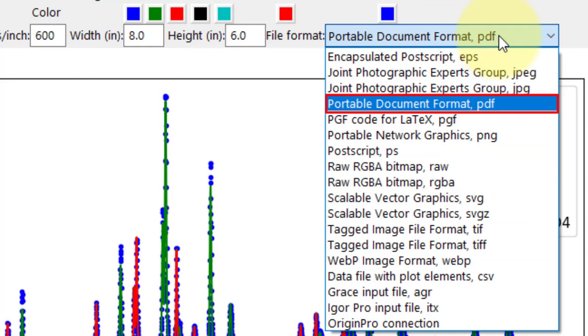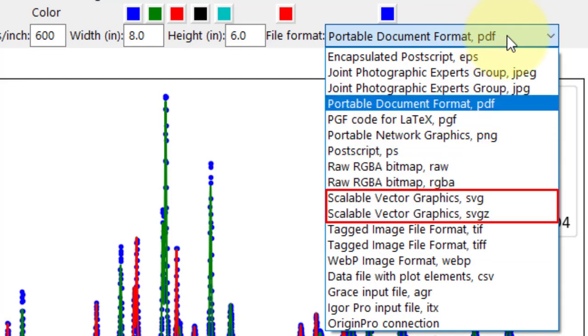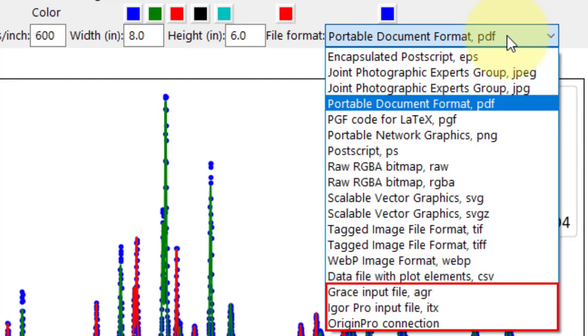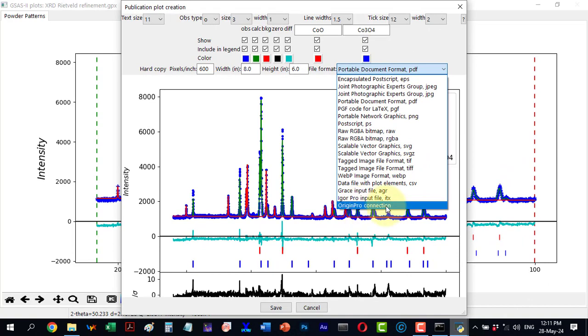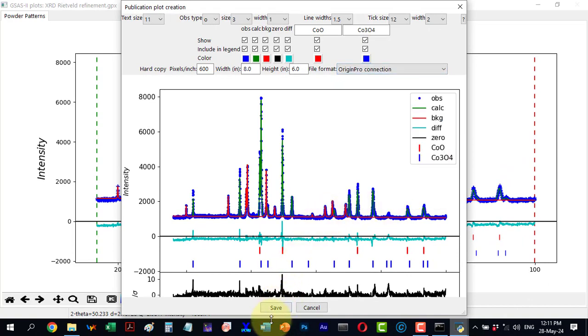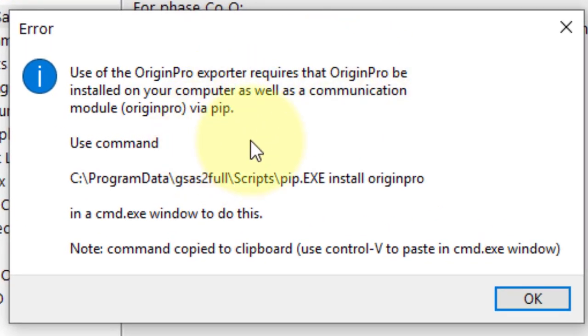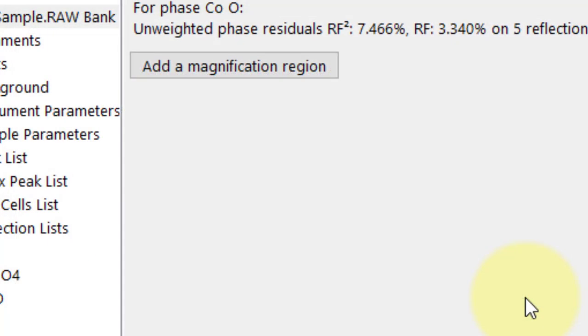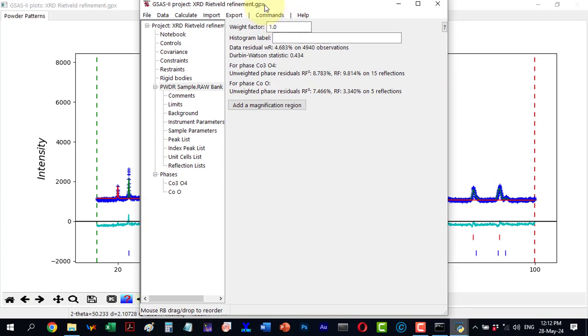We can also export to formats like RAW files, vector graphics, CSV files, and input files for software like Grace, Igor, Pro and Origin Pro. If I select Origin Pro and try to save, an error appears indicating further installation is needed. GSAS2 is Python based, so we need to install Origin Pro through pip. An alternative is to export the data and plot in Origin separately.